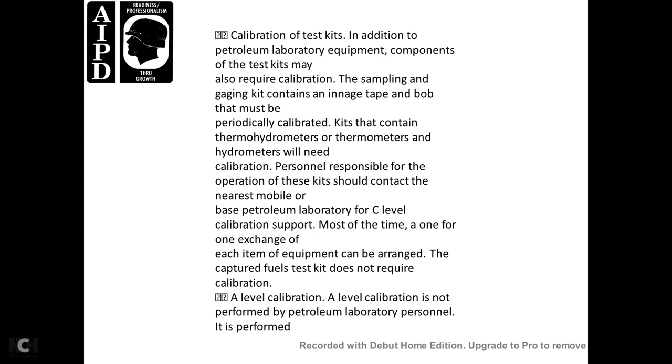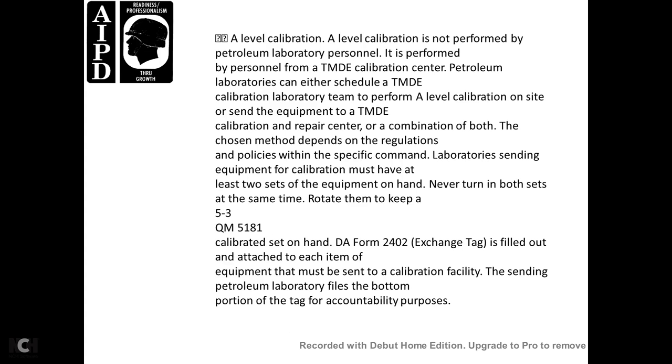The test kit does not require calibration. A-level calibration is not performed by the petroleum laboratory personnel. It is performed by personnel at the TMDE calibration center. The petroleum laboratories can either schedule a TMDE calibration laboratory team to perform an A-level calibration on site, send the equipment to the TMDE calibration repair center, or use a combination of both. Choosing the method depends on the regulation policy.